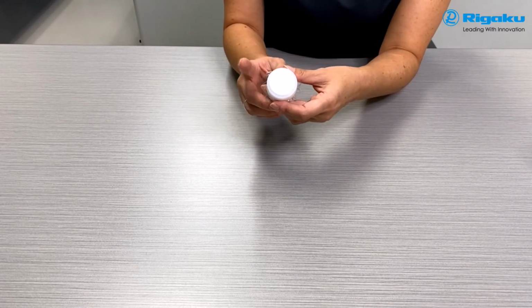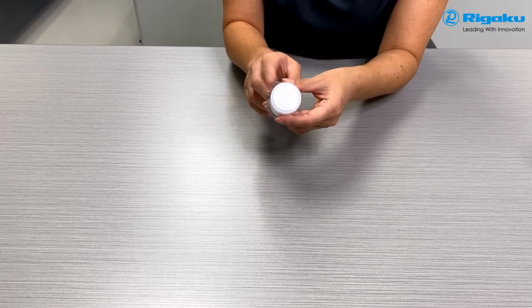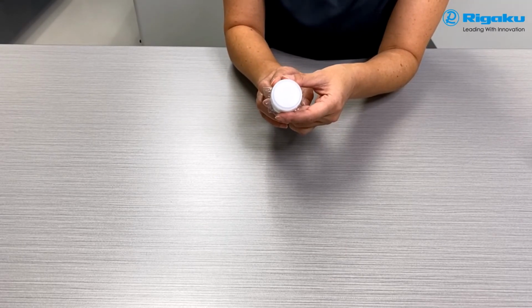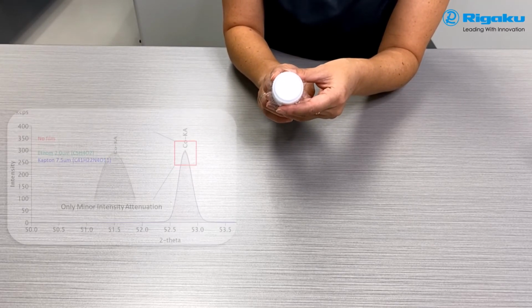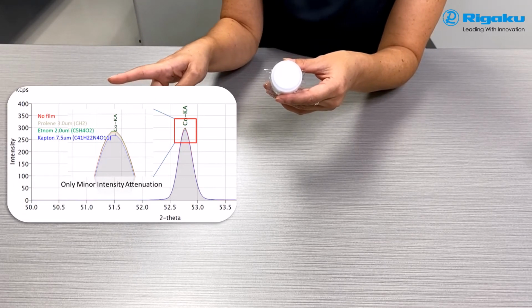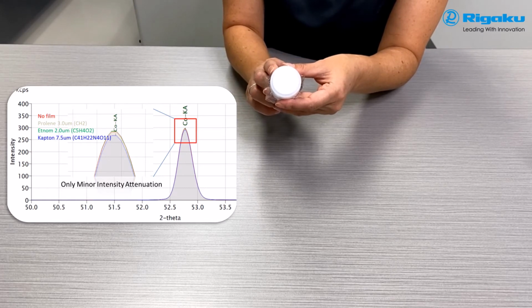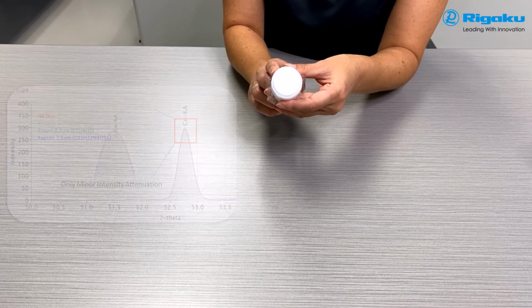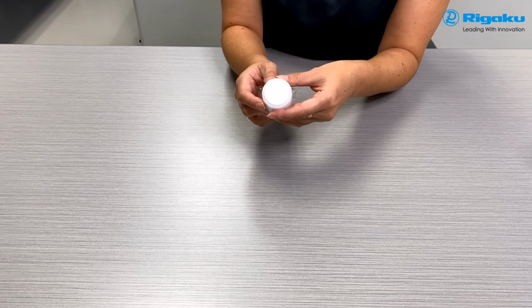Okay, so now there's another thing to consider after you've tested everything we've recommended, which is the elements of interest that you want to see from your material with the type of film that you're using. For instance, here, as you can see, for cobalt, which is a transition element, it's not being affected a lot by the type of film. It's more energetic, so even a thicker, heavier film is not going to impede those X-rays.